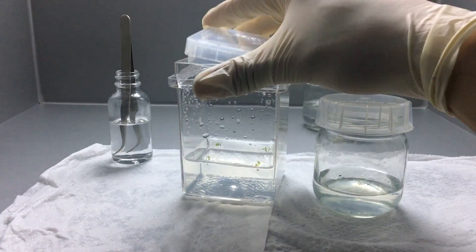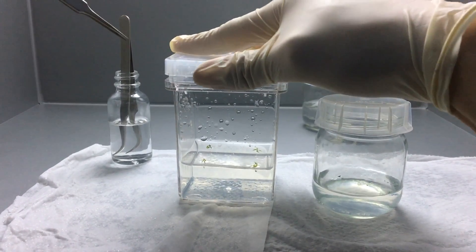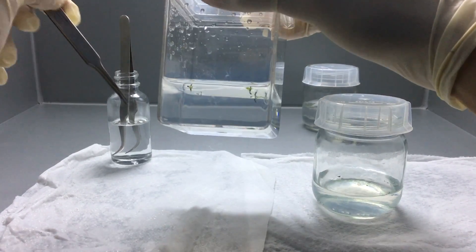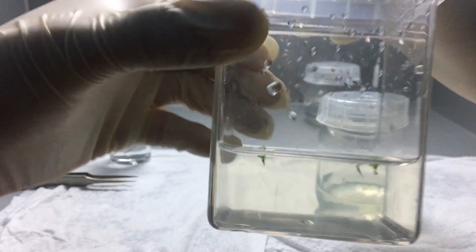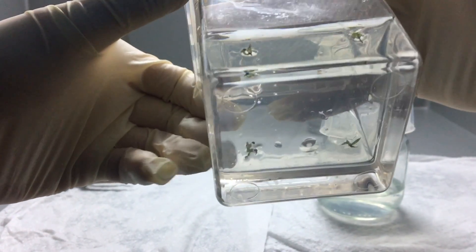All right, so we're all done. We got four roots under the media line and four little plants growing right above. Everything is looking perfect in there.